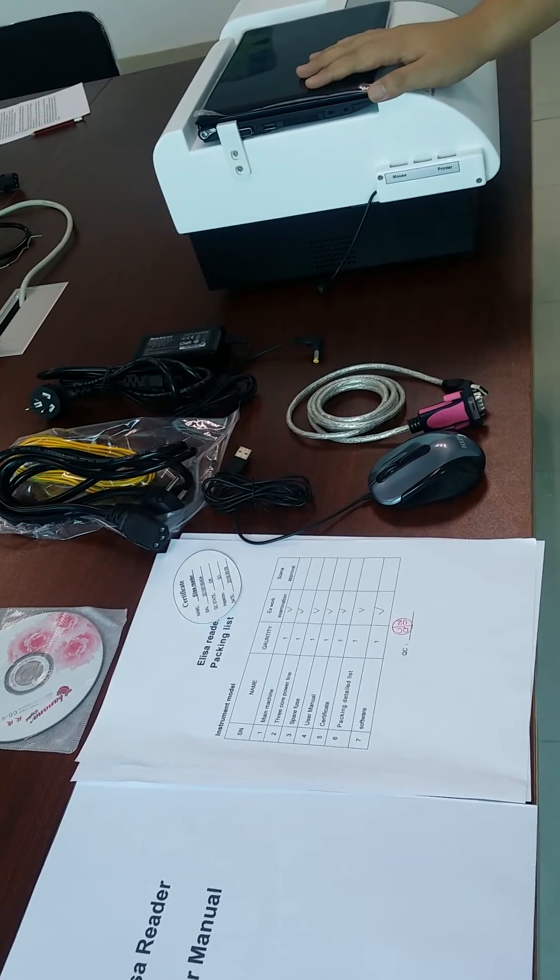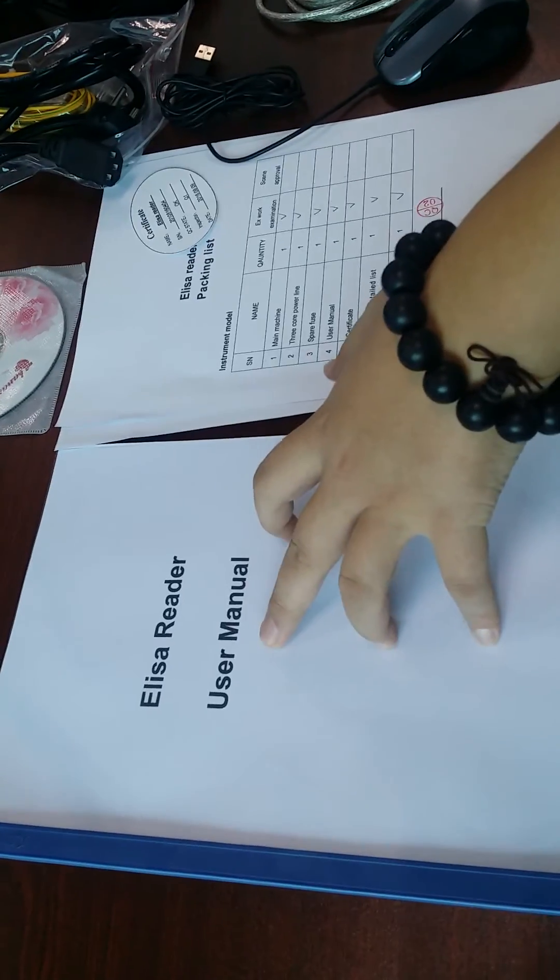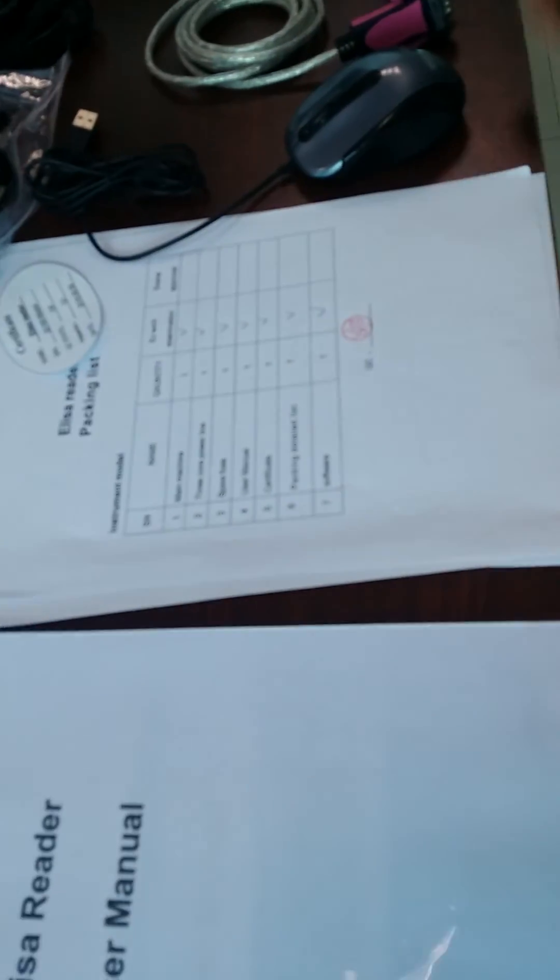First, after you open the packages, you will find some documents: the user manuals, packing list, and the user guides.